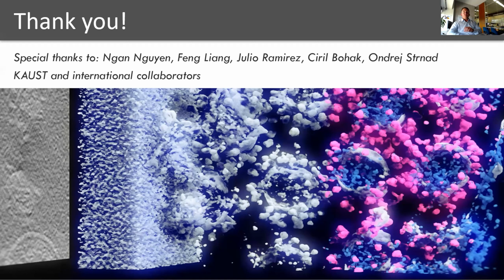So in fact, imagine that you do the tomographic reconstruction first, you have a noisy volume, and then you perform denoising. You actually do not know how far you are from the original projections. You lose that connection. You only operate on your noisy volume, and you do not have the reference to the original projections. In our case, each iteration is basically using the projections to stay close to the ground truth.